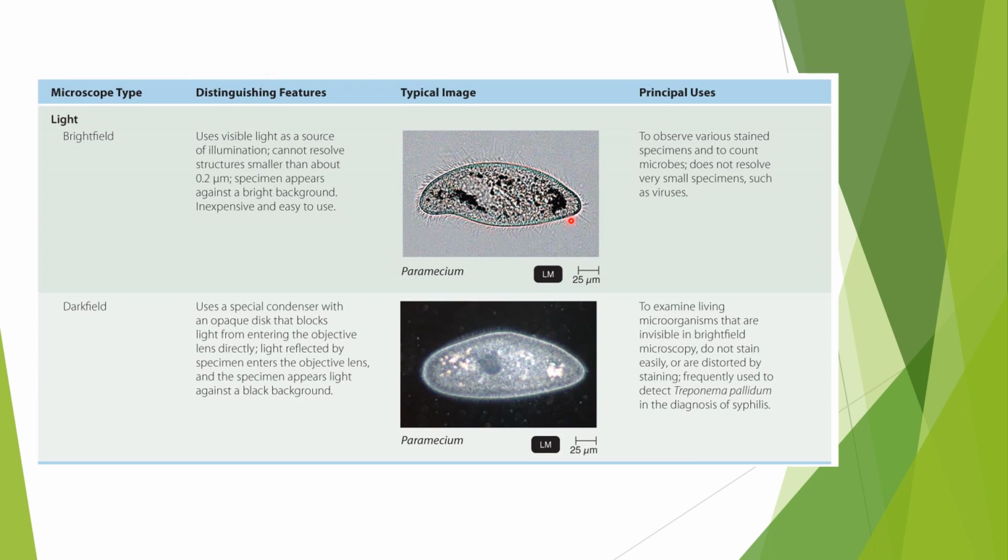And this type of microscope can show you a bunch of different types of bacteria, for example. But it's not going to be used for viruses, by the way. Viruses are too small. This type of microscope is not going to work to view viruses. I'm sorry.